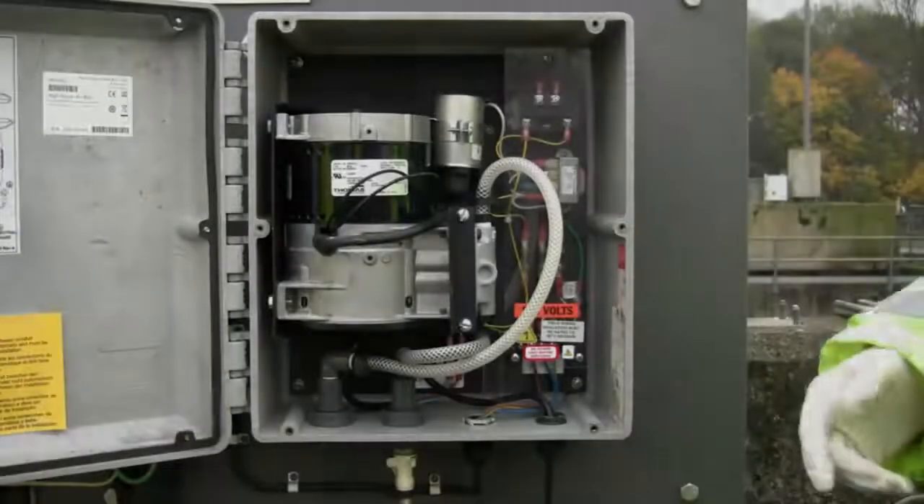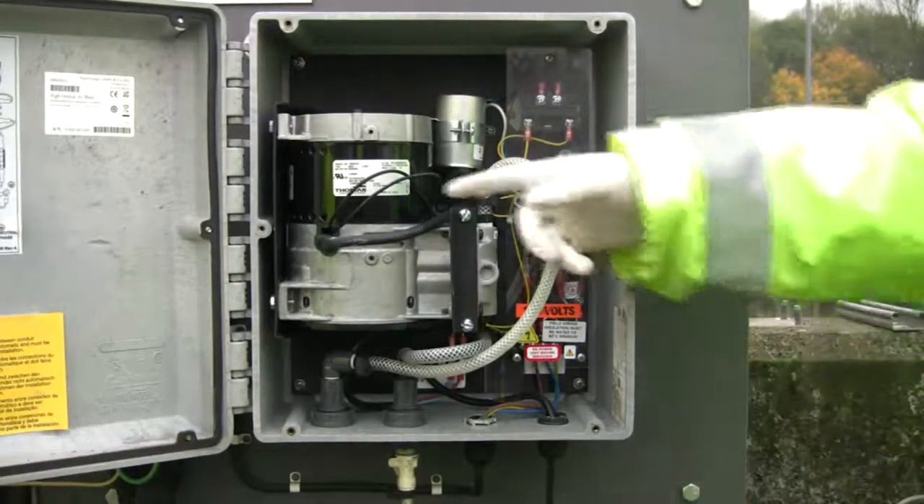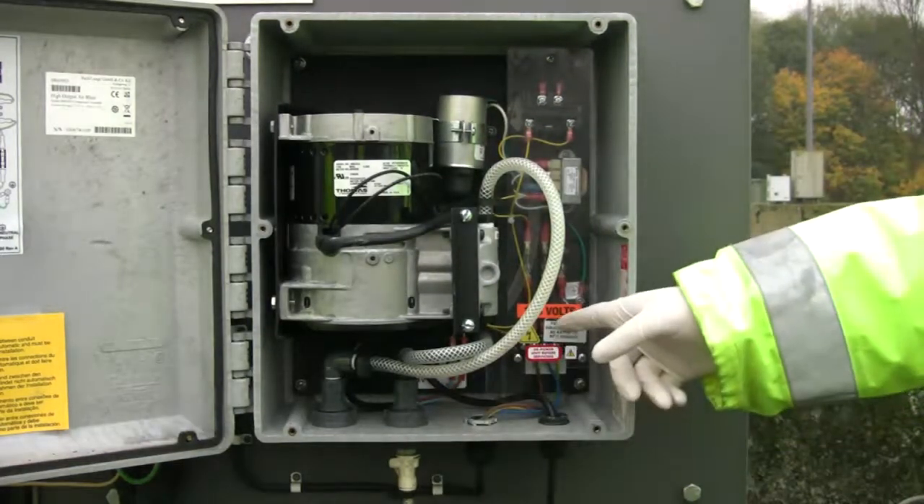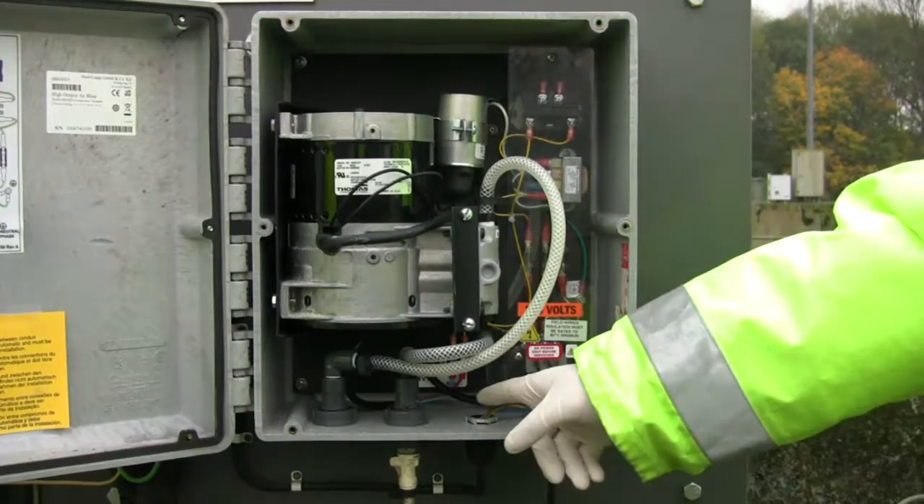On the inside of the compressor, you will find the compressor, the air delivery system, the power terminal block, and the relay block.